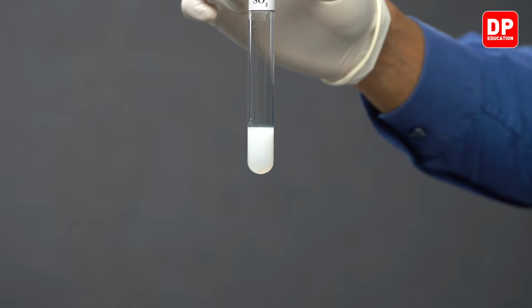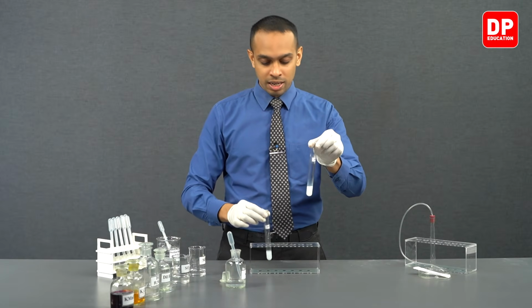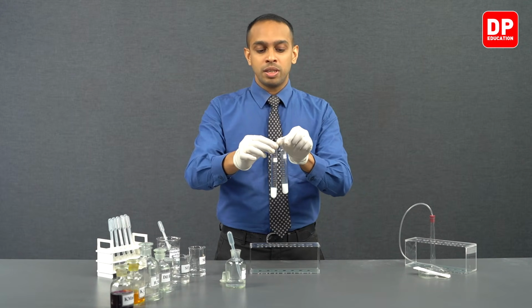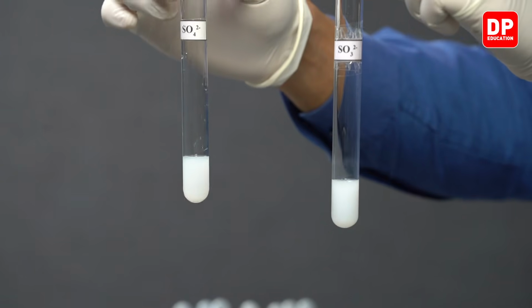This white precipitate was formed due to the formation of barium sulfite. Barium sulfite is a water insoluble precipitate, just like barium sulfate. So let's compare it side by side. You can observe barium sulfate over here.